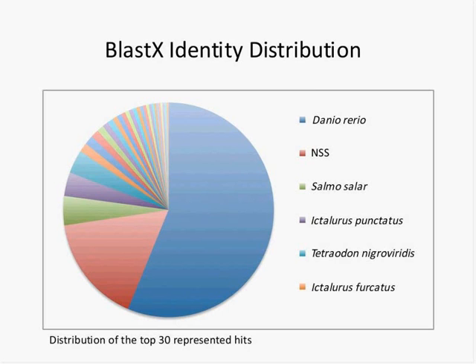So where did our BLAST hits land? The majority of them, if you look here at this pie chart for the top 30 represented hits, the majority of our hits came from Danio, which we would expect.